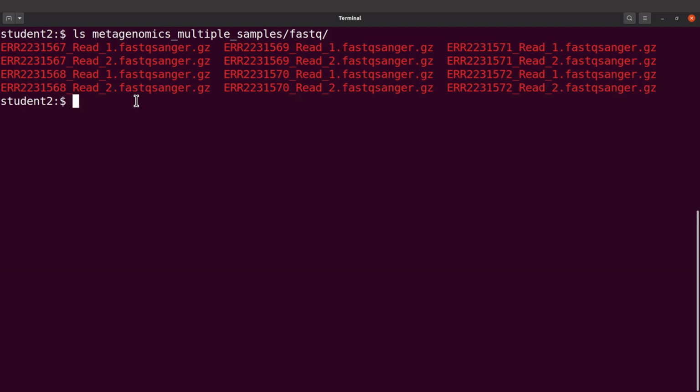So in this tutorial, I'm going to explain everything to you. I'm going to give you the steps that you can use to write your own bash scripts and assemble metagenomic sequence data. The knowledge you get from this tutorial can also be applied on other data sets. If, let's say, you are assembling sequence data using SPAdes or other assembly tools, you can use the same principle. Okay, so it all boils down to you having a good naming convention. If you have a good naming convention, it becomes easier to take the files and then process them. So I'm going to give you all these tips in this tutorial.